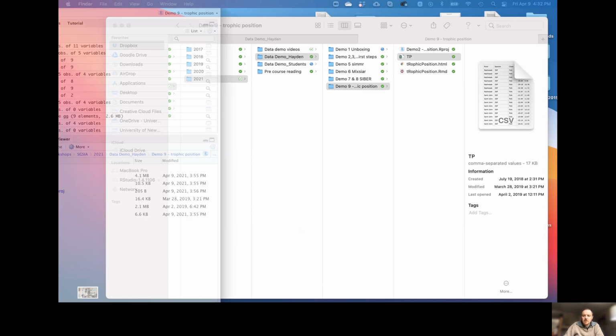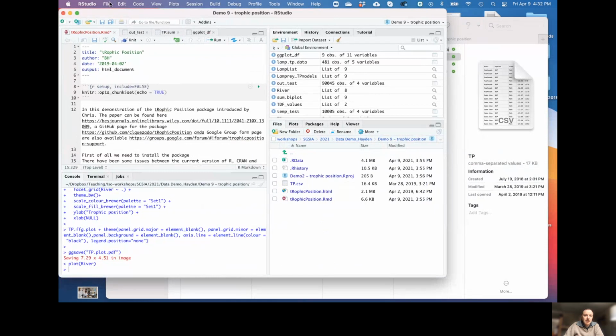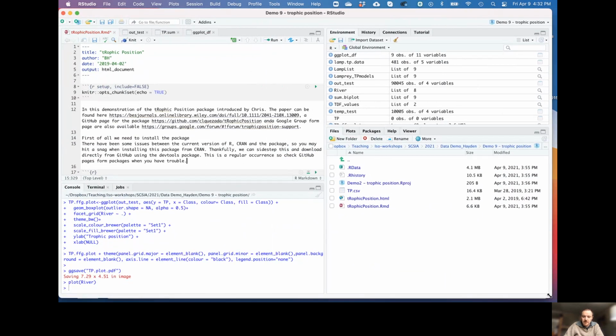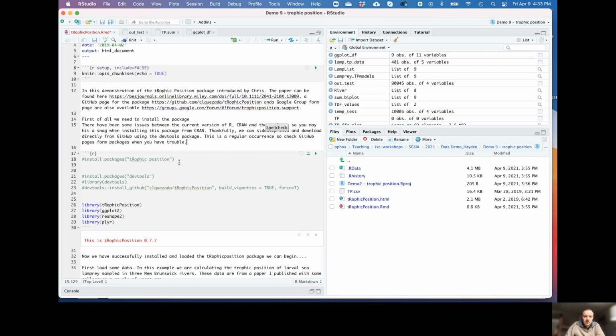So what we want to do, as we've done previously, is open up RStudio and create an RStudio project in the folder that file is in. And then we can start, let's see, we're going to tidy this up a little bit. Get rid of that down there. Okay, and then we can start running the actual analysis. So as before, we've got some notes and things like that in here, and you can follow through, and you have all of these files, and you can run this, and hopefully everything should work.